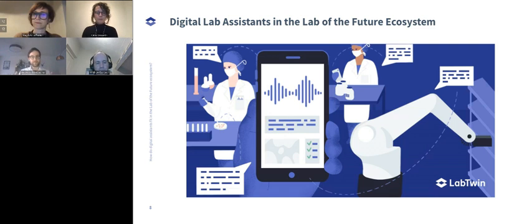You can think of, okay, I now buy something like a liquid handler. Why do you do that? Well, of course, what you want to gain is a certain throughput, meaning instead of having a human standing at the bench and pipetting, that can be done by the machine. What that does now is, you have to give that machine input, like work lists, meaning what sample should go from which source well to which destination well. And sometimes that must be generated somehow.